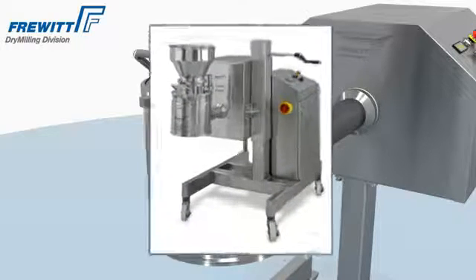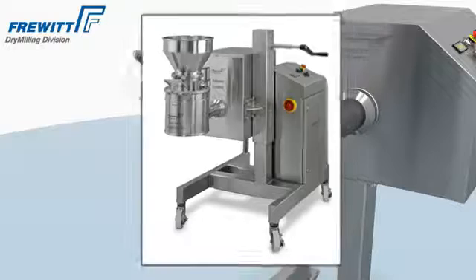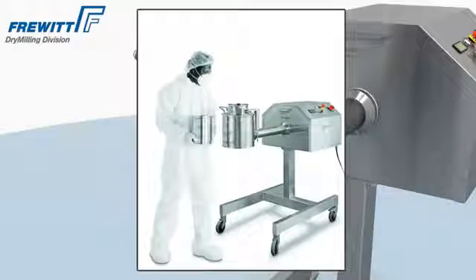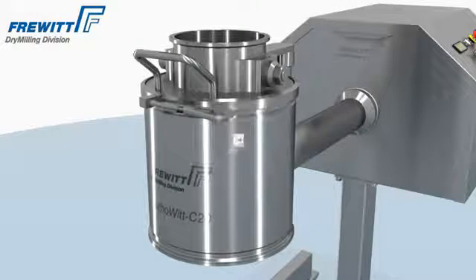The TurboVit C20 combined with a Conivit 200 and height adjustment. Each TurboVit can be changed easily into a Conivit mill system.